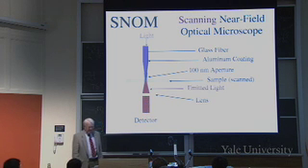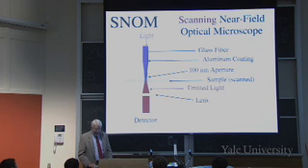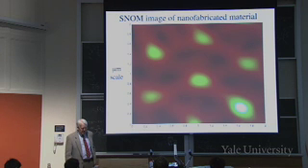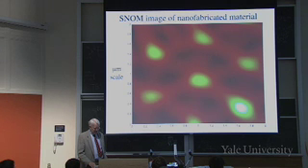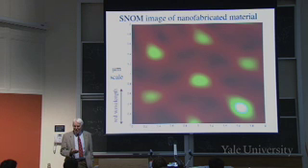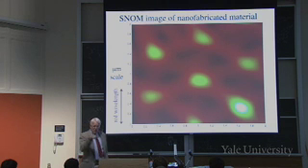Okay, so red light comes out and you have a detector that detects it, and you scan the sample back and forth like a TV, right? And you find out where such molecules are. And here's a picture taken in that way. So this is a scale of microns, right? 2 by 2 microns. In fact, it's a distorted scale, as I see here. And that double-headed arrow is the wavelength of red light. So you're seeing things significantly smaller than the wavelength of the light, having done it this way. You're not really looking with your eye, you're doing this scanning trick, right?